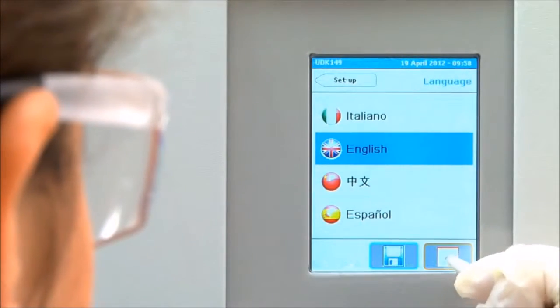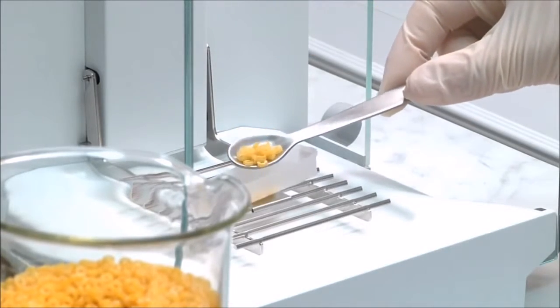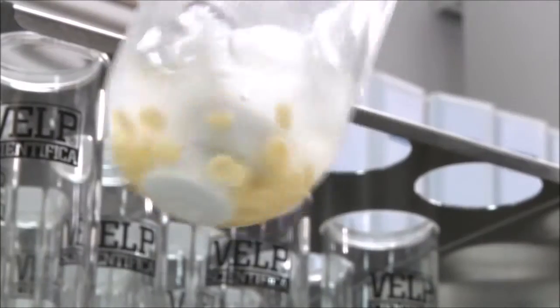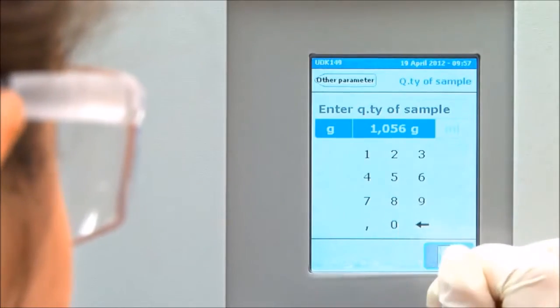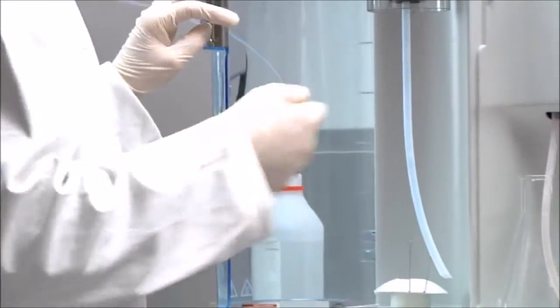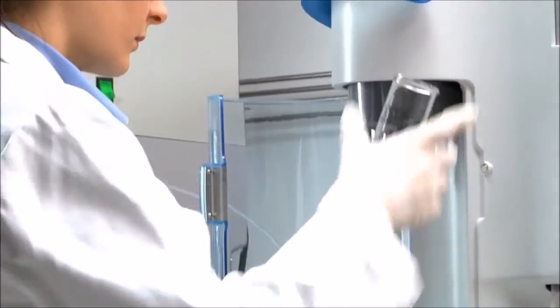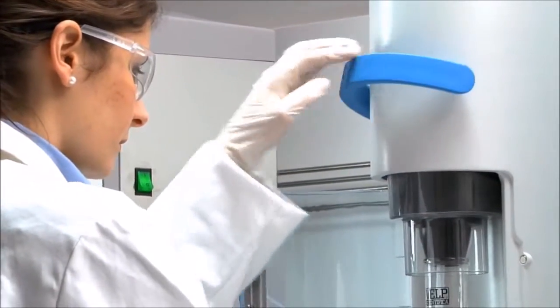The most commonly used languages are pre-installed. Kjeldahl analysis is ideal for solid, semi-solid and liquid samples. Accurately homogenize the sample, weigh and transfer it into a VELP glass test tube according to the official method. Sample tubes are inserted without any effort, using the comfortable lever to displace the tube support and clamping the tube in place.